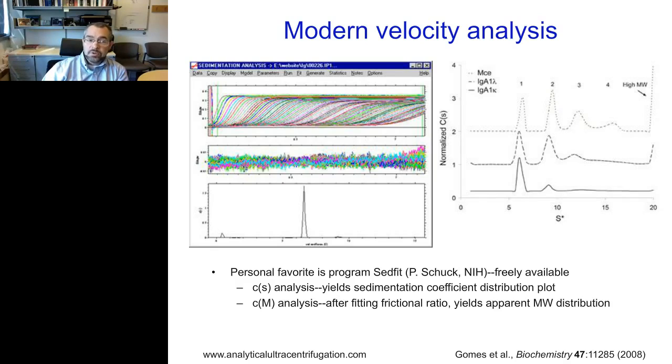It may be highly purified, but you have some other things going on here that you need to think about, especially if you're trying to pull out some details about binding constants or thermodynamics. You need to really understand what you're dealing with. All right, I will keep moving on.